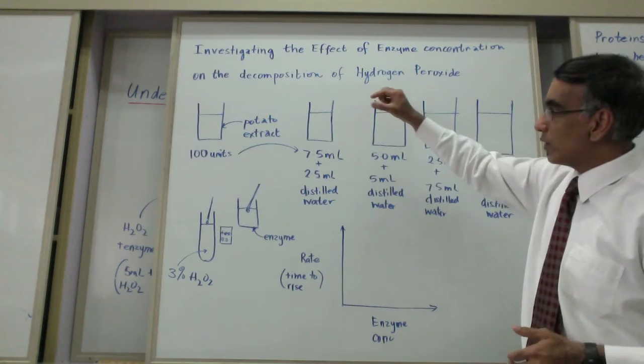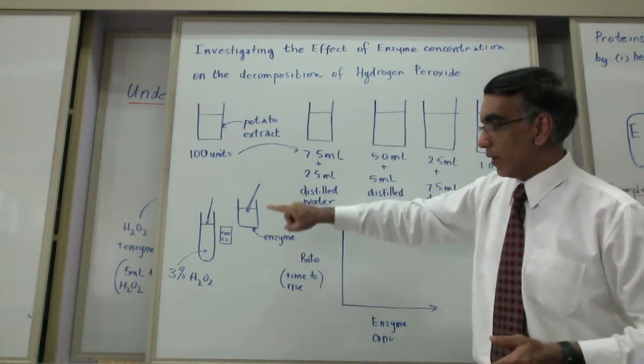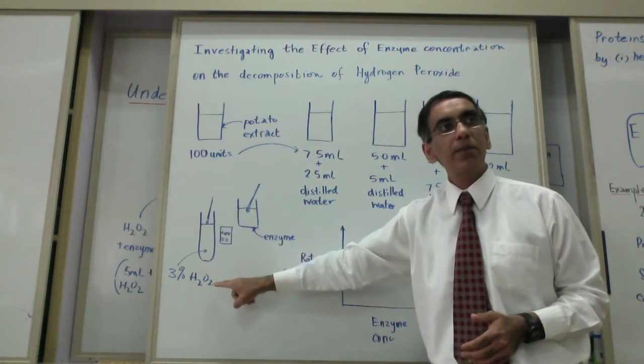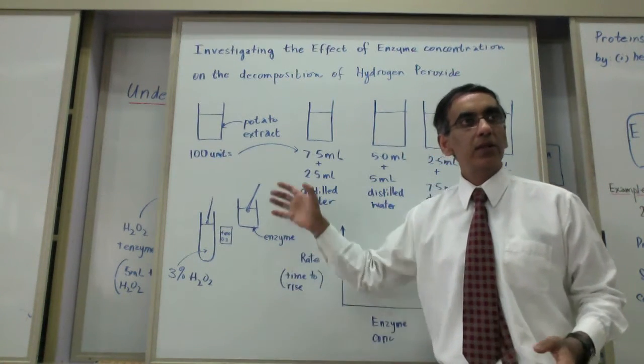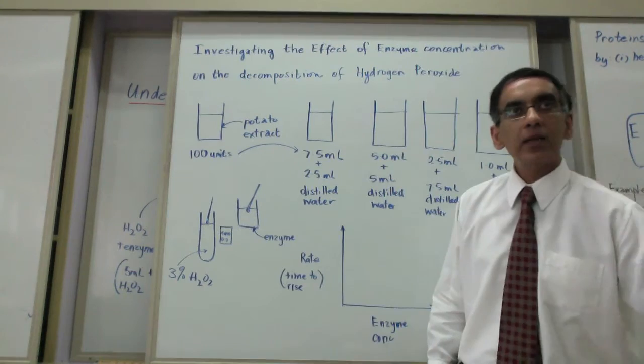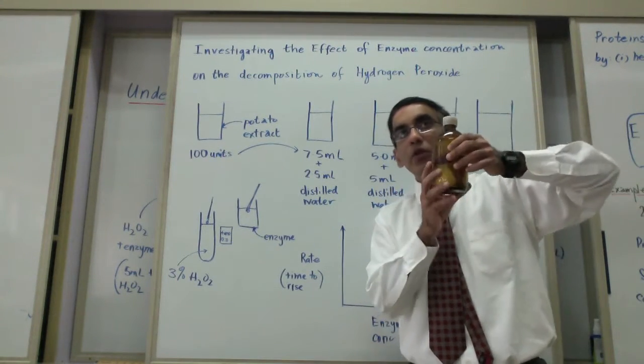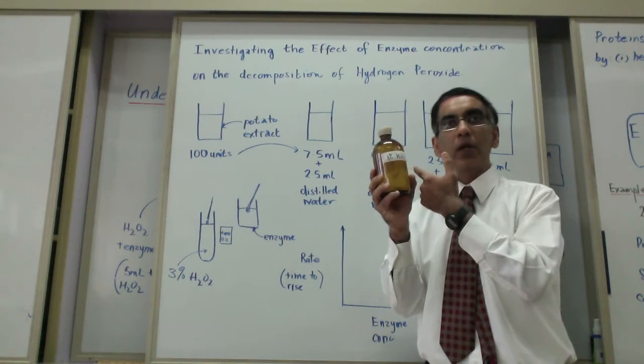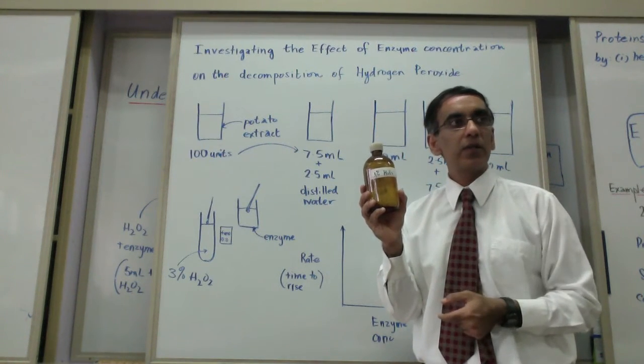And then once you've got a dilution of the enzyme, then you will take a test tube and fill it up to about the 3/4 level with the substrate, which is not being interfered with today. We're not diluting it, but at another time you can choose to see what the effect of substrate concentration is by coming up with a range of dilutions for substrate concentration.